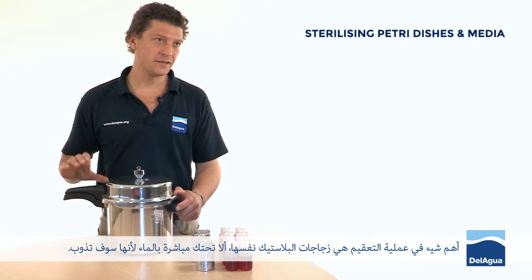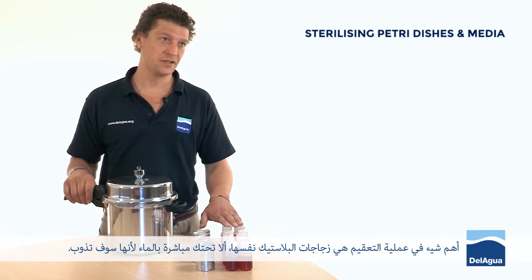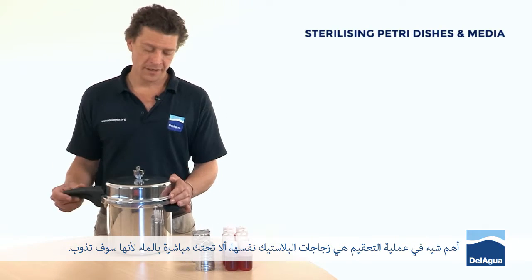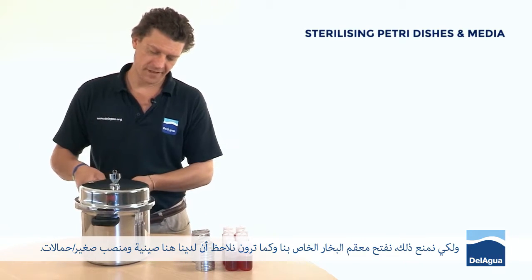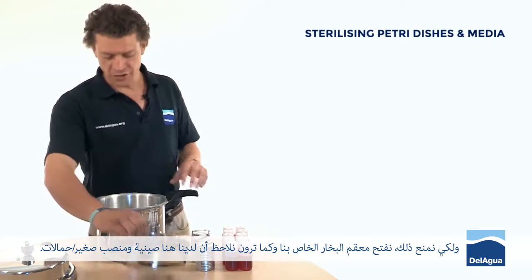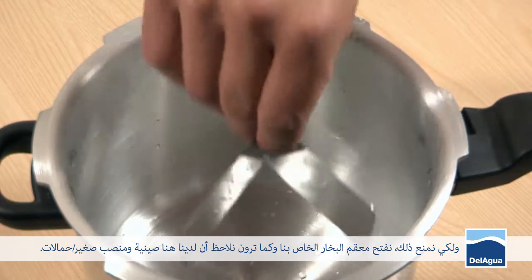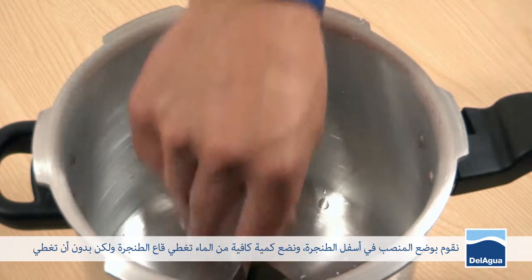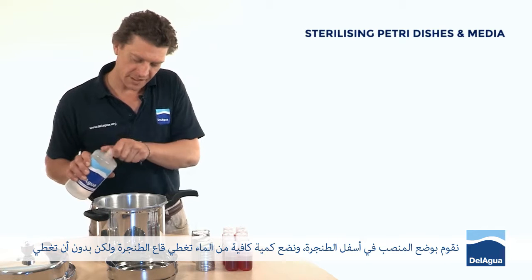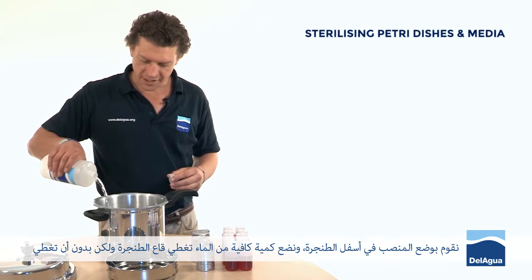The important thing with sterilizing is that the plastic bottles themselves don't come into contact with the water, because they would melt. In order to prevent that, we open our steam sterilizer. You'll notice inside there's a load tray and there are a couple of cradles, supports. We place those in the bottom of the steam sterilizer, and put sufficient volume of water to cover the bottom of the steam sterilizer, but not to cover the top of the support.